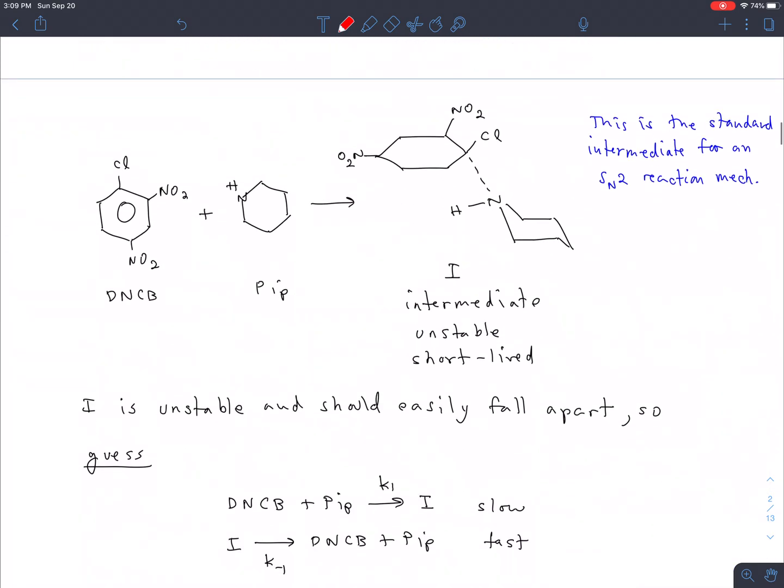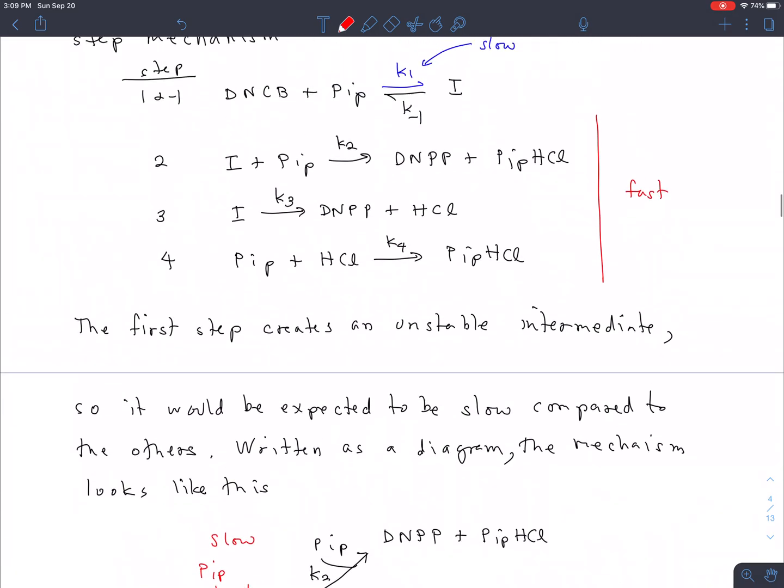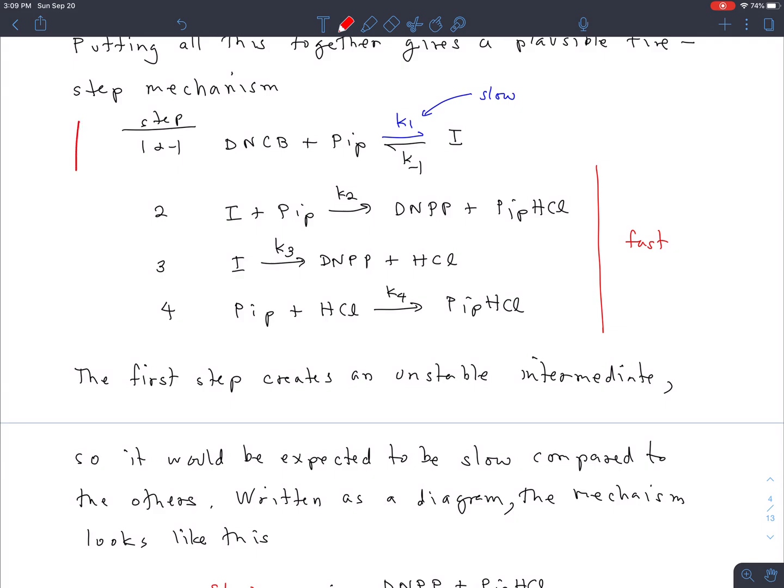But let me just say that, after talking about the nature of the chemical reactions that are taking place here, we can write down a 5-step mechanism, but one of those steps is a slow step. It's a rate-limiting step, or so we assume anyway, and the data are consistent with that, which means that all these later steps, these fast steps, don't affect the rate at which the products appear very much.